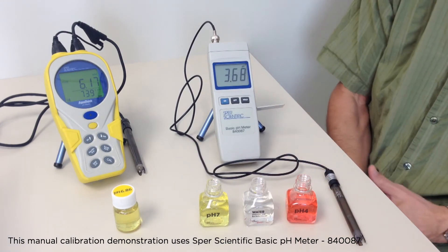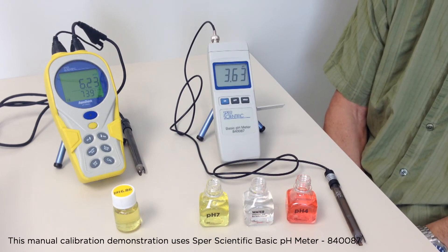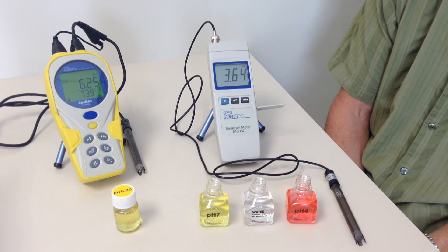This meter is now calibrated, which ensures that it will read within its specifications and be especially accurate between those two points. We could also have calibrated to a single point, but this wouldn't be as accurate.